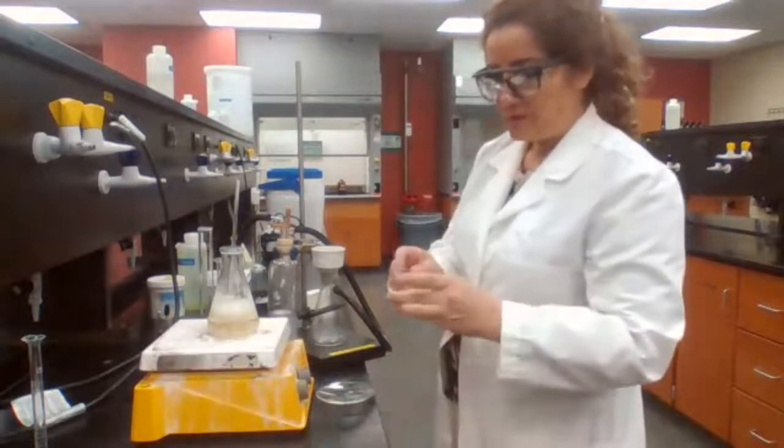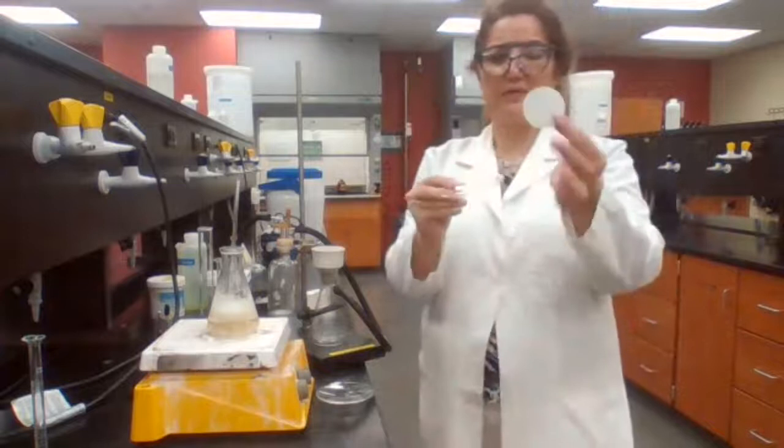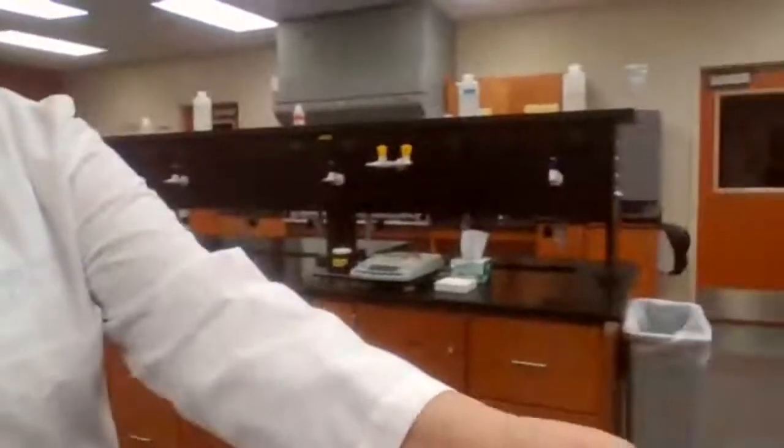I'm going to measure the mass of the filter paper with a watch glass. I want you to record that number.